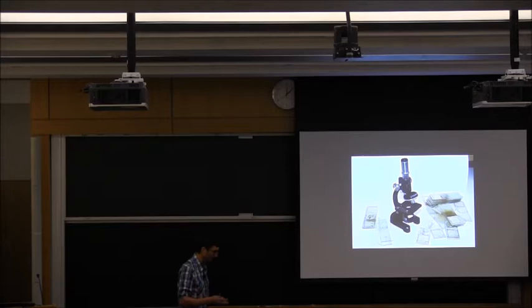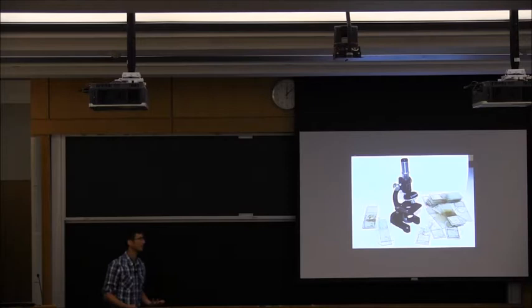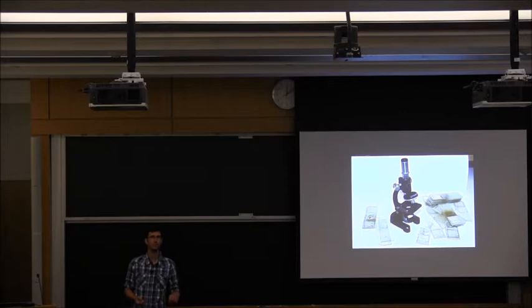But what I said a couple weeks ago was, if you take a look at one of the inverted microscopes in our facility, they don't look all that different from this. So obviously the objective is down underneath them, they're inverted. But we still have that same basic structure to a microscope that we had even hundreds of years ago. And that's because we always, until recently, were just dealing with very, very thin samples on slides. And that's how microscopes were designed. It was always just to handle these thin slides.